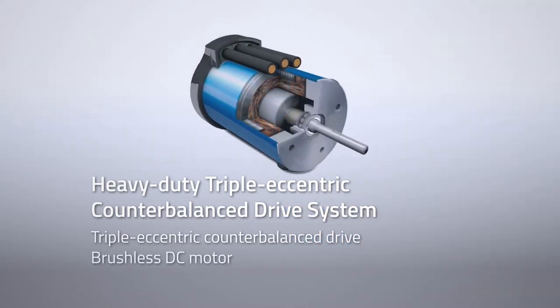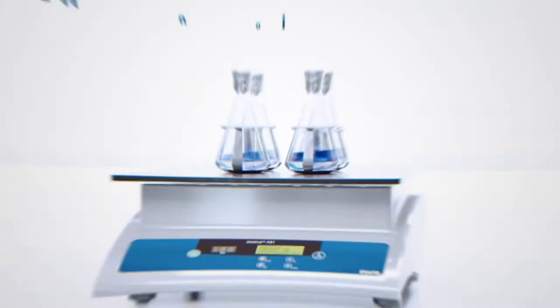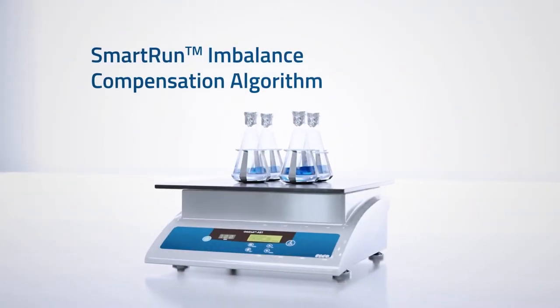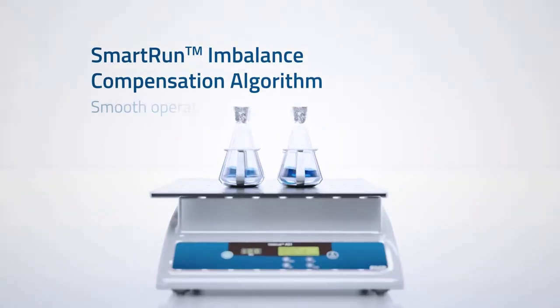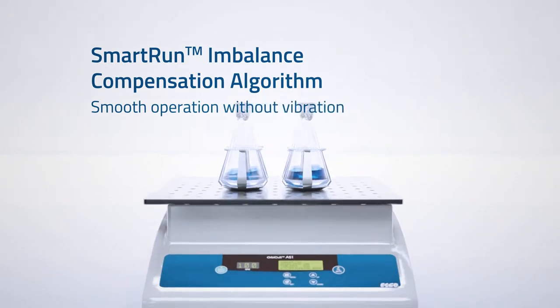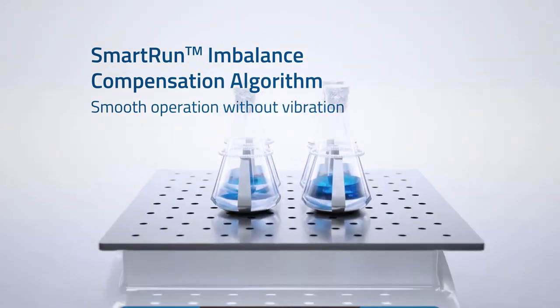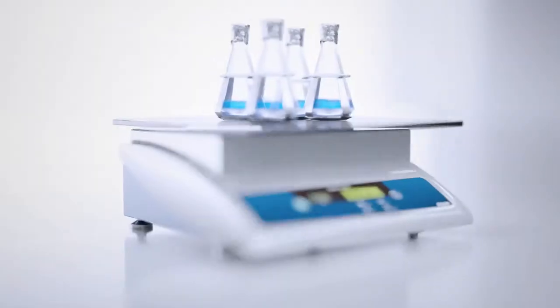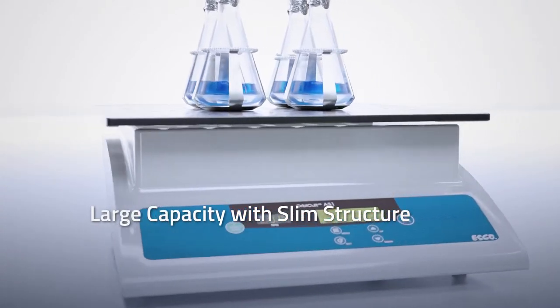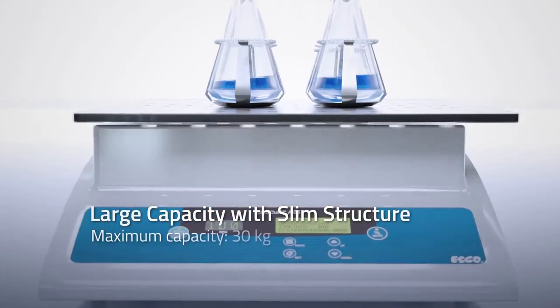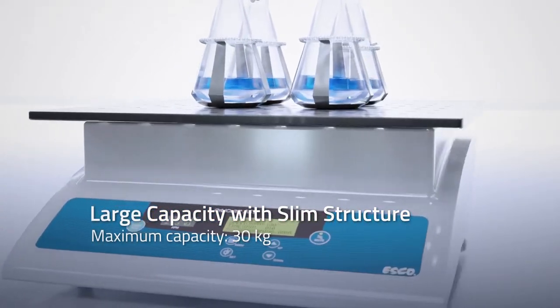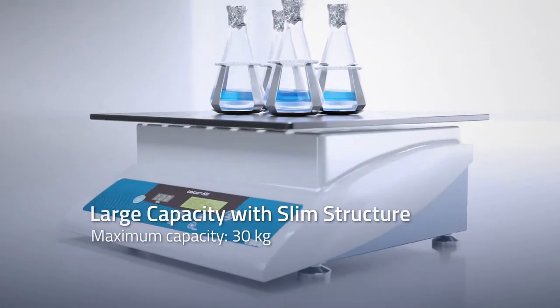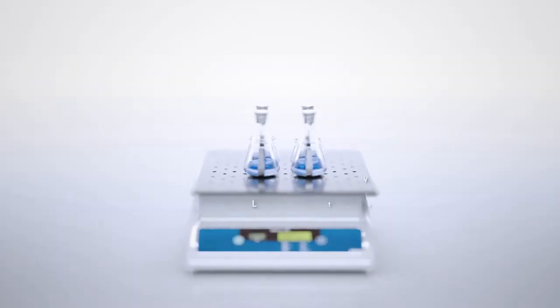It provides excellent speed control, smart run and balance compensation algorithm. It ensures smooth operation without any vibration, large capacity with slim structure. It has a maximum capacity of 30 kilograms.